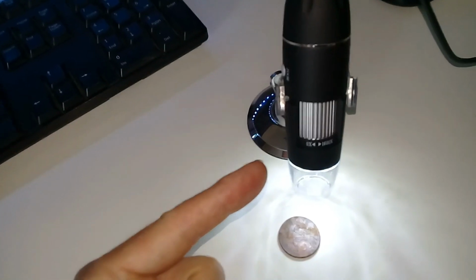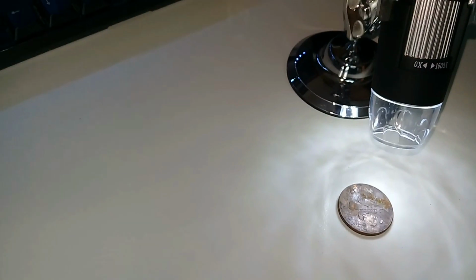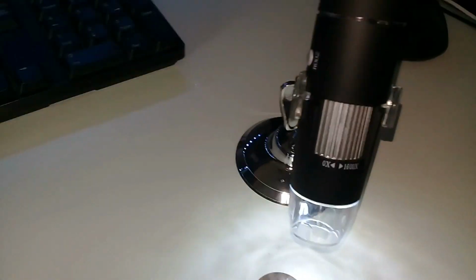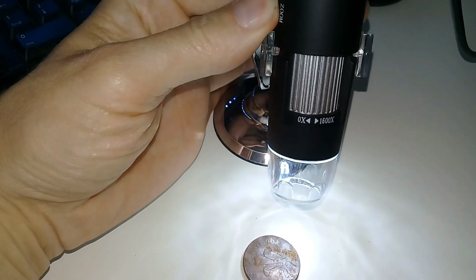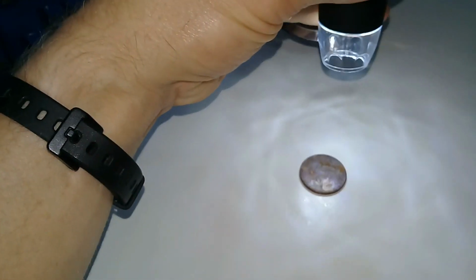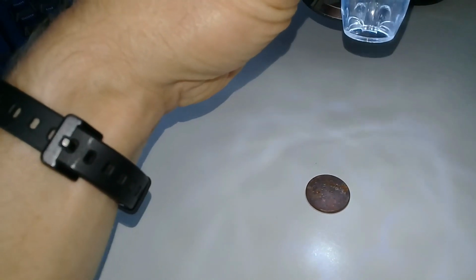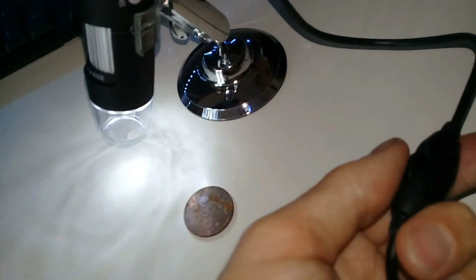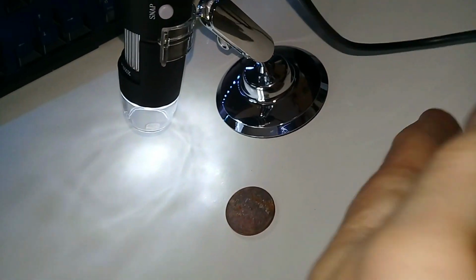The stand isn't great. If you want to zoom out, there's a snap button on the side for taking still pictures, but this is all a bit wobbly, so you might want to do something with that, because you need to lift this up and focus it in to come away from the object. It's hard to do it when it's there. So you can see there's the image that I'm getting. This does control the brightness, this lever. So if I can, that's as bright as it goes.